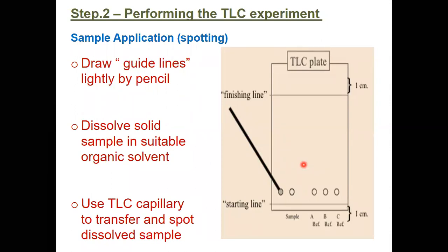Next slide shows the performing the TLC experiment. First is the sample application, which is known as spotting. In this, on the TLC plate, first draw guidelines very lightly with the help of the pencil.